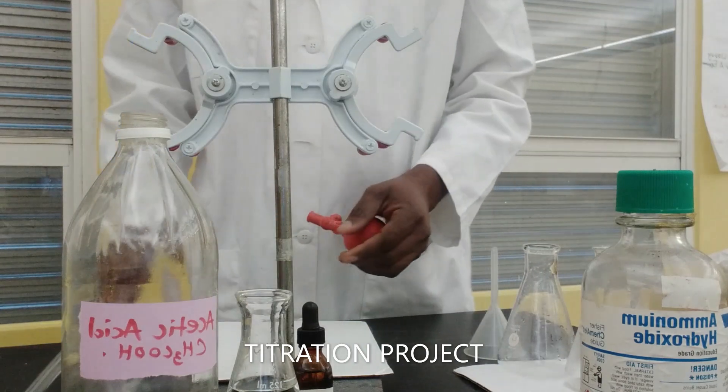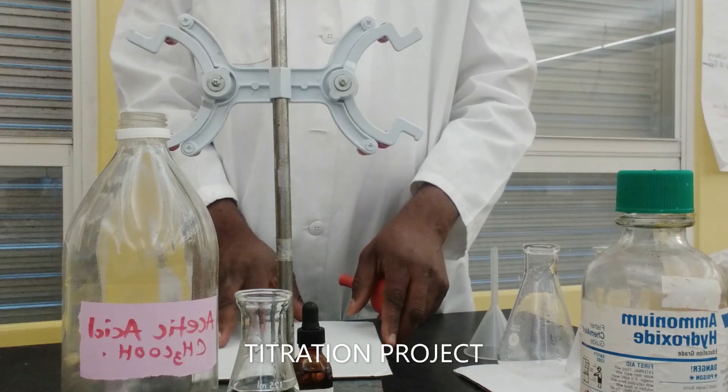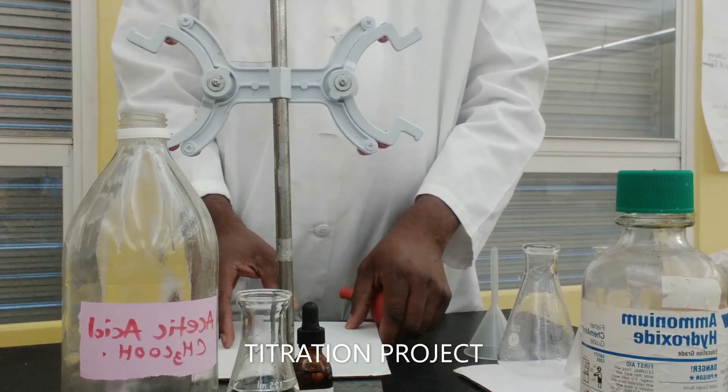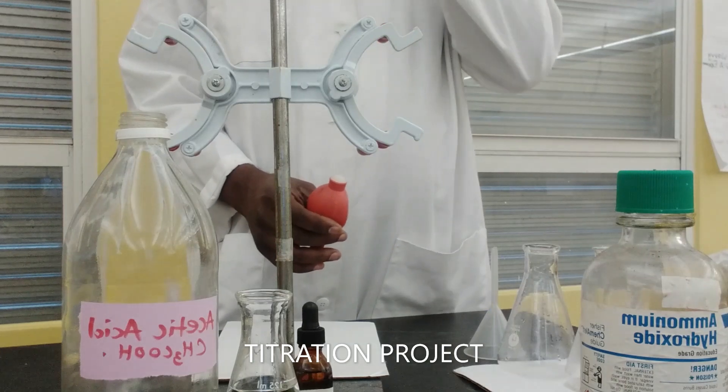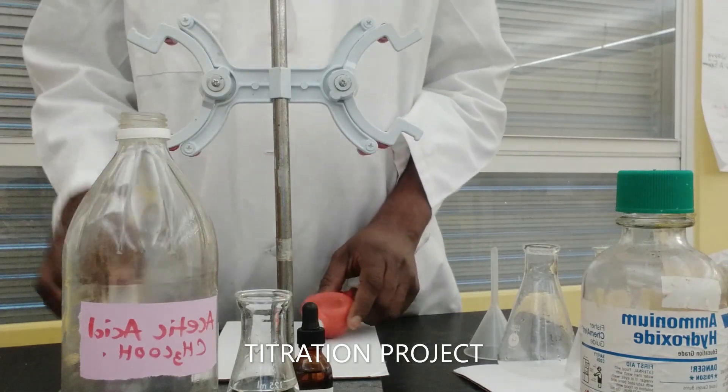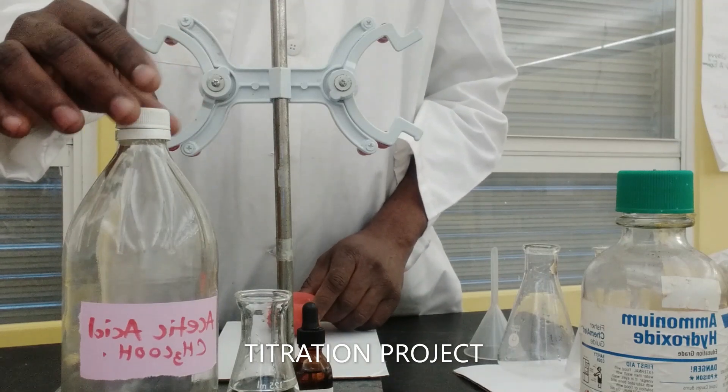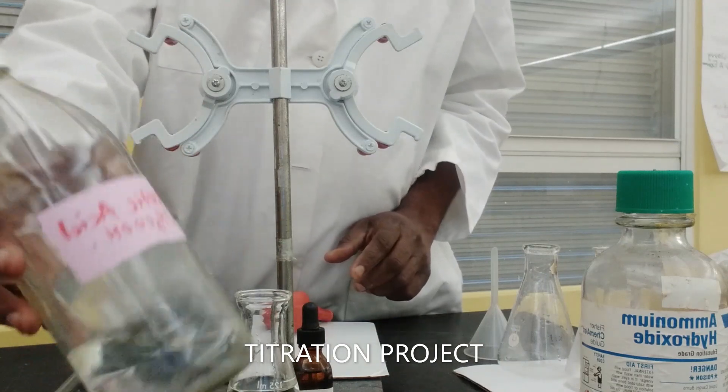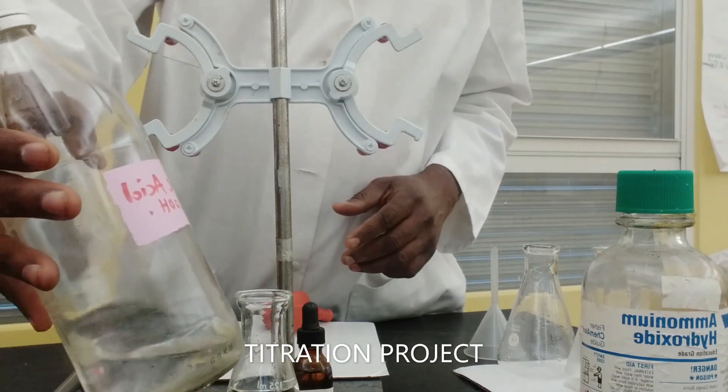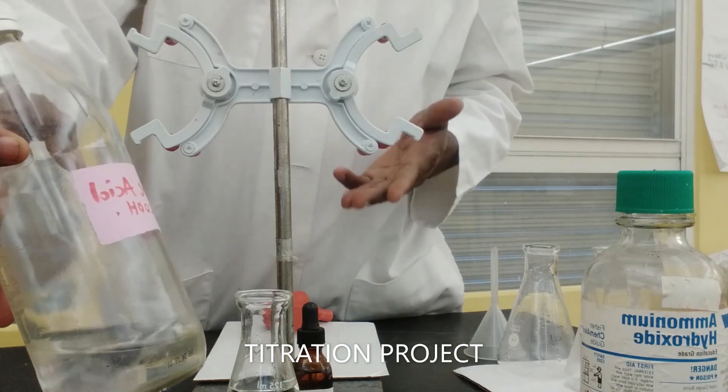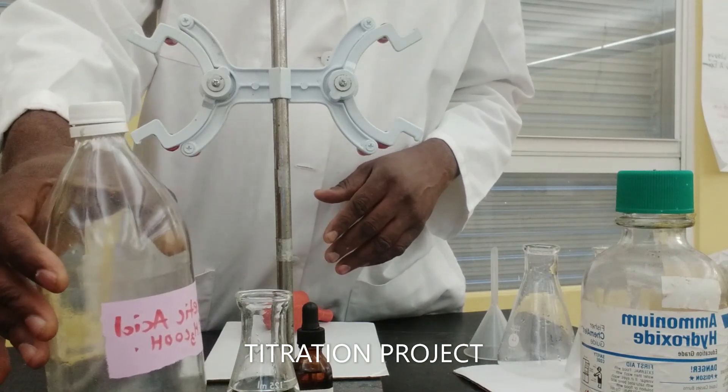Today we'll be doing an experiment on acid-base titration, which is also referred to as volumetric analysis. In today's experiment, we would be titrating a weak acid, acetic acid.